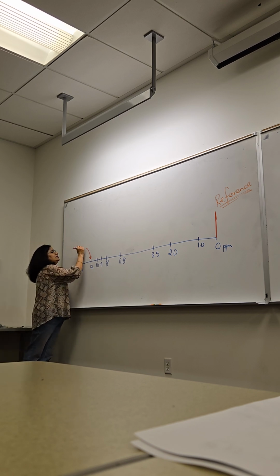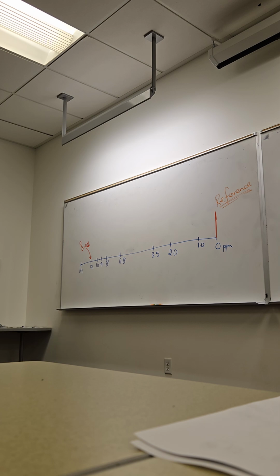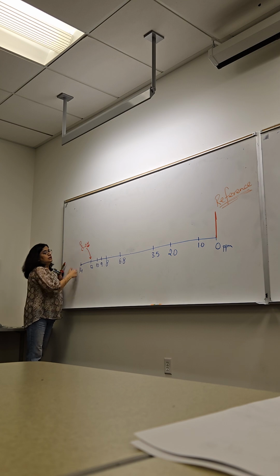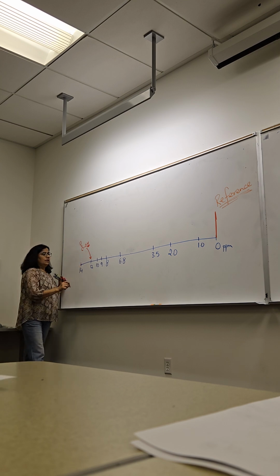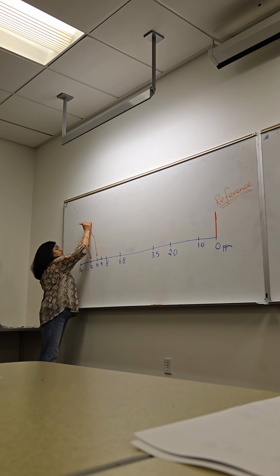And that is the hydrogen in a carboxylic acid. There is no other hydrogen that is more de-shielded, meaning electron density has been pulled away from the hydrogen, than that.